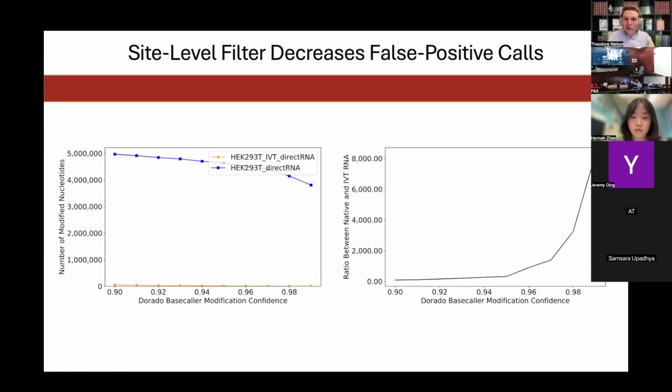So what is known, of course, is that for certain k-mers, for certain sites, we looked at those squiggles, those lines. For some sites, it's just easier to measure whether the m6A methylation is present or not, and easier to differentiate that based on the modification confidence scores. And that ultimately has to do with the way that the training data set was constructed by Oxford Nanopore Technologies, factors that we don't know the inside details about, but that we can start to back-calculate from the data and the models as we're given them.